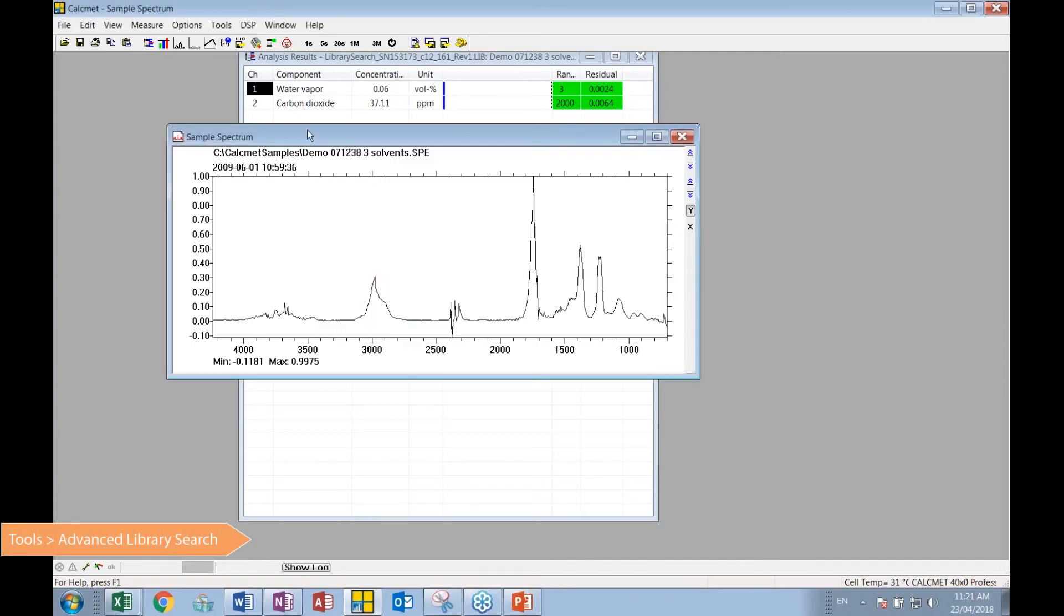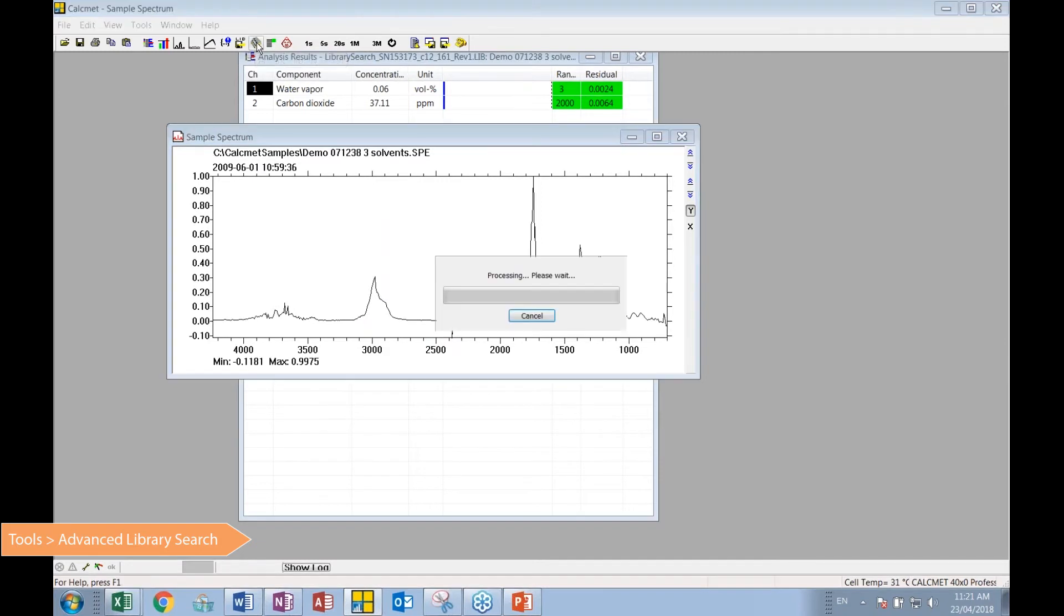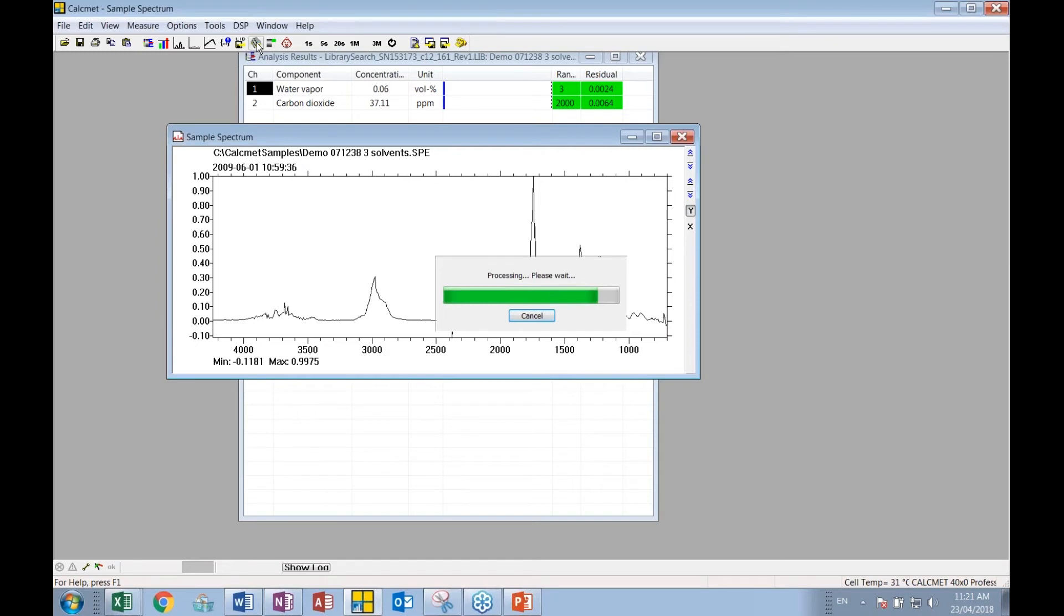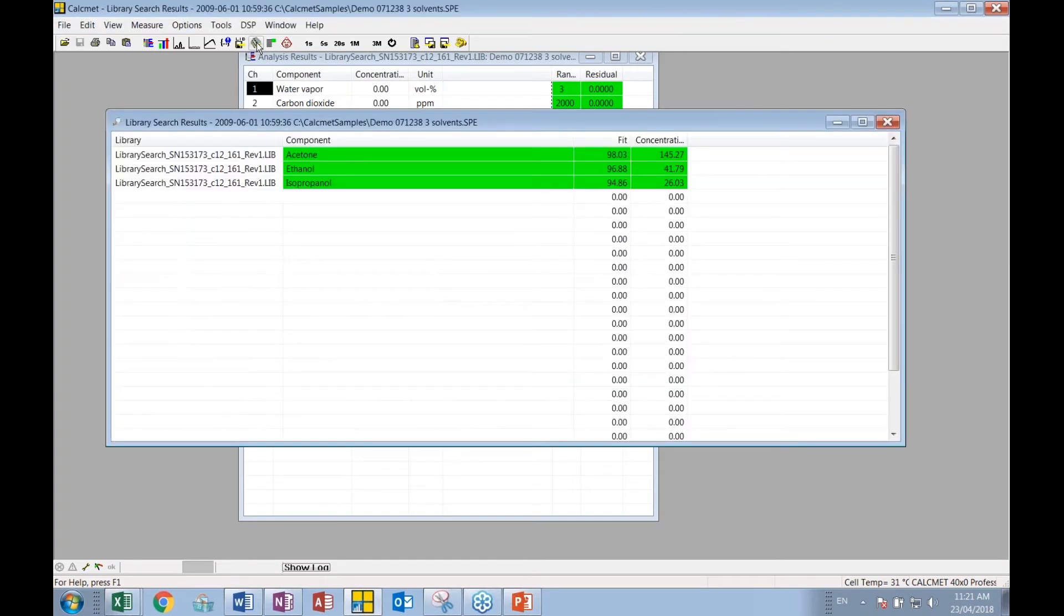So with that in place, the user is simply going to ask for the software to scan through the reference database and do a statistical match on what it sees here. 12, 15 seconds or so, depending on the computer.